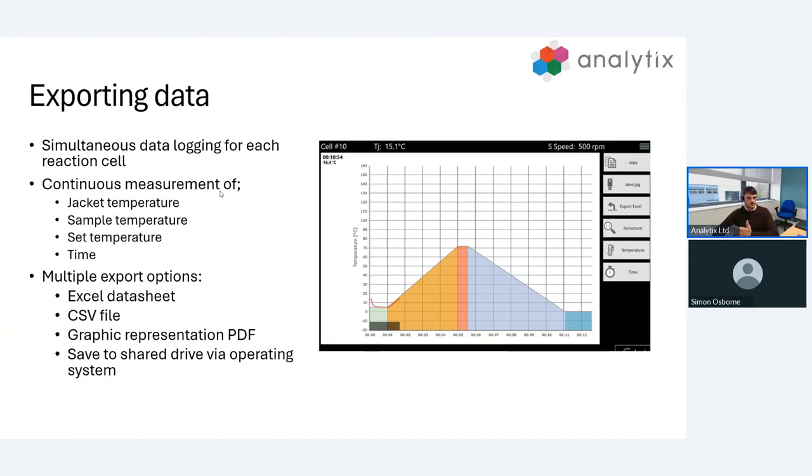Data recording is excellent, so we need to be able to export this and actually use it in the real world setting. We have multiple export options. We can export directly as an Excel sheet and open this directly in Excel. We can export as a CSV file or as a graphic representation via PDF. Rather than exporting by Excel and then making the graph yourself, you can export a graph very similar to the one on the screen now. You can modify this using the software. Also, as we're using Windows 10, you can save it directly to the system in a folder and access all runs at a later date.